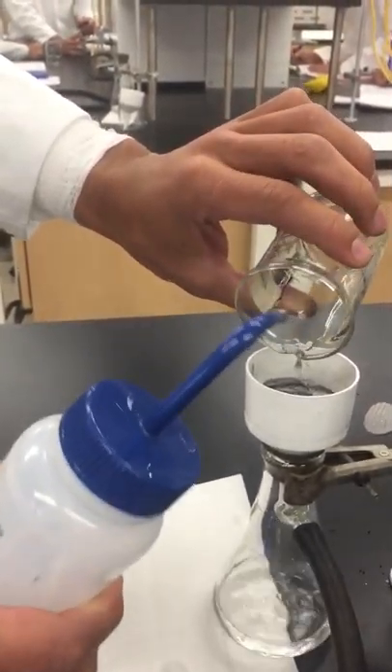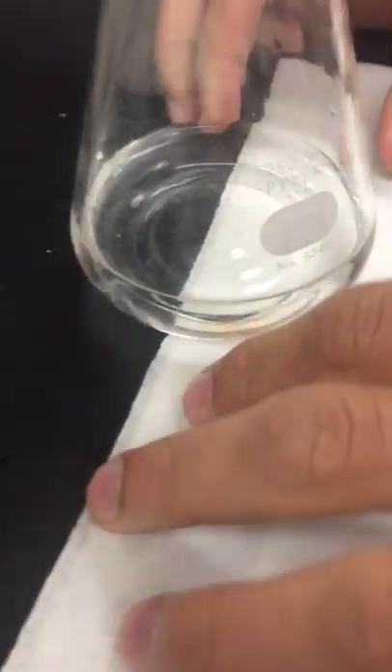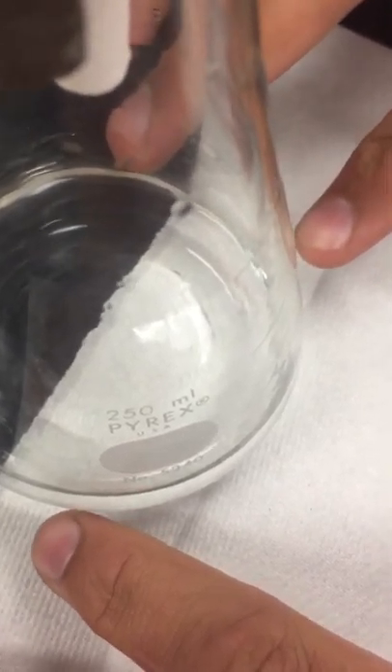As you can see, we've had a pretty good filtration. Sometimes I like to put a white paper towel underneath because you can often see if the solution is contaminated or not.